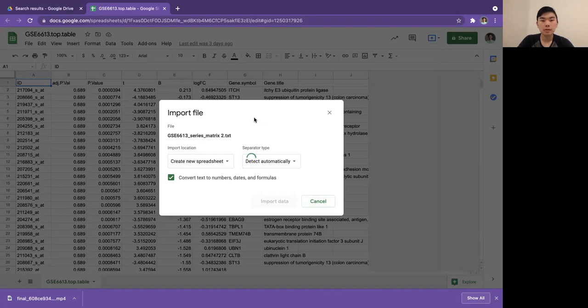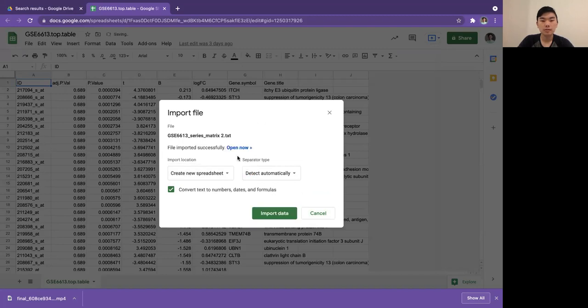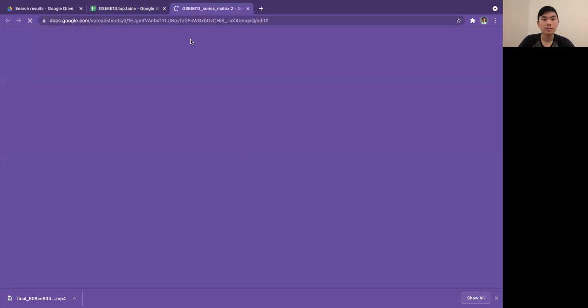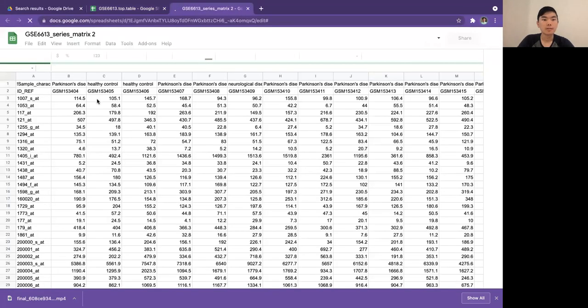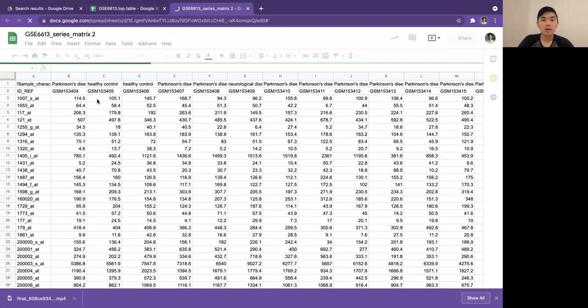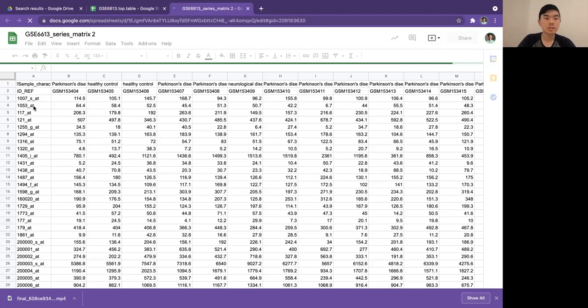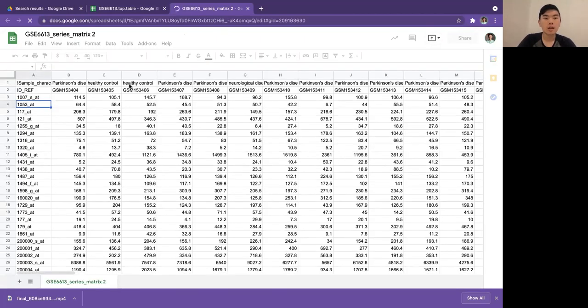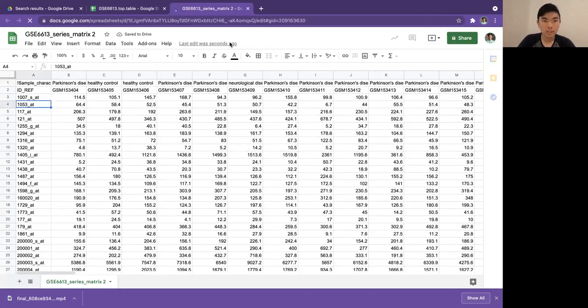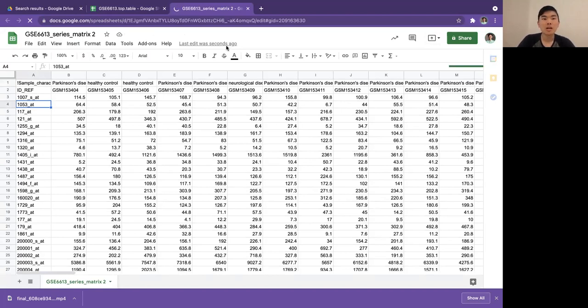So while it's running, just to refresh... oh never mind, it just finished. Normally when you download the result data set from GEO2R after analysis, you get a bunch of rows where each row is a gene, and the columns have information like the fold change, the p-value, the name of the gene, etc.